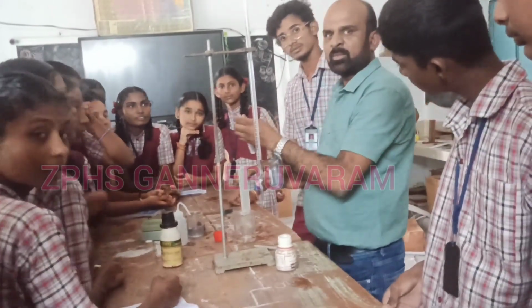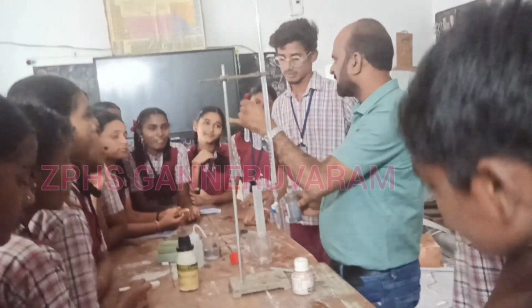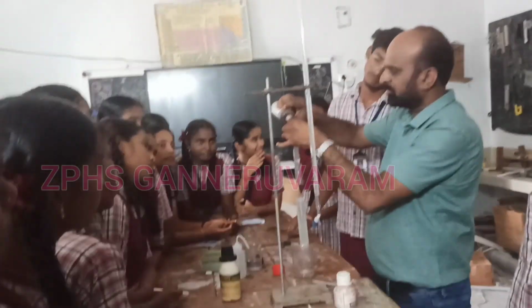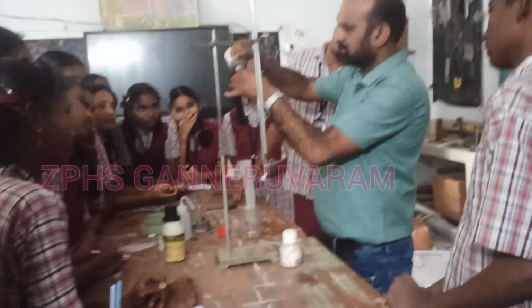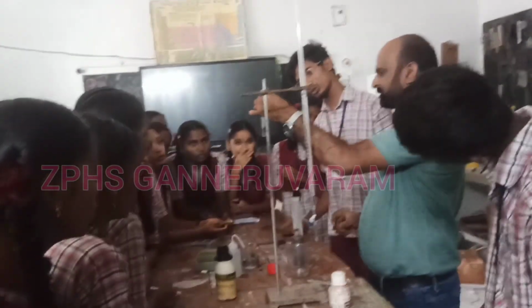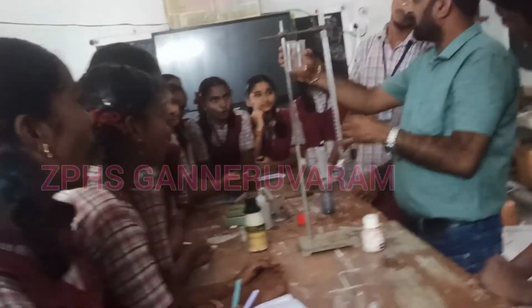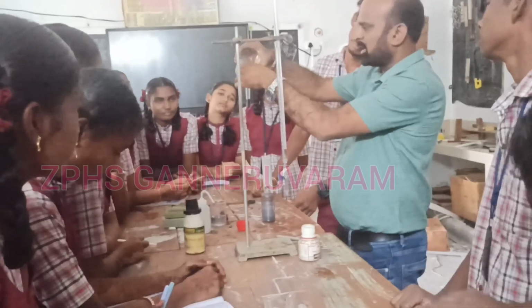Still the sodium hydroxide solution I have taken in the test tube, and adding one drop of red litmus. It comes to blue color. Now I am adding the hydrochloric acid solution. Okay, now I will do this.